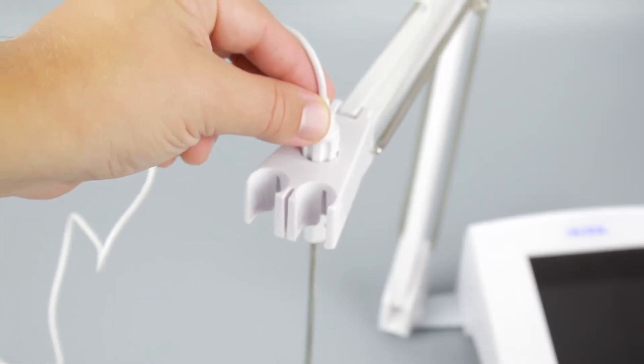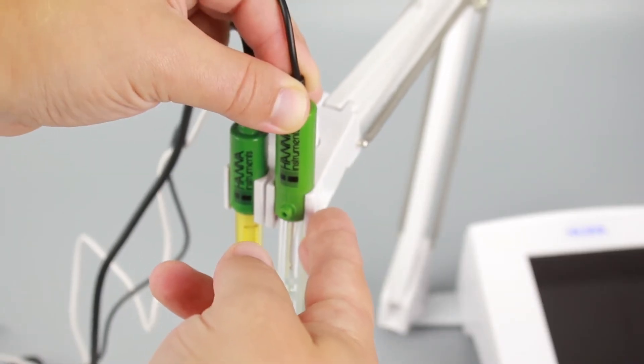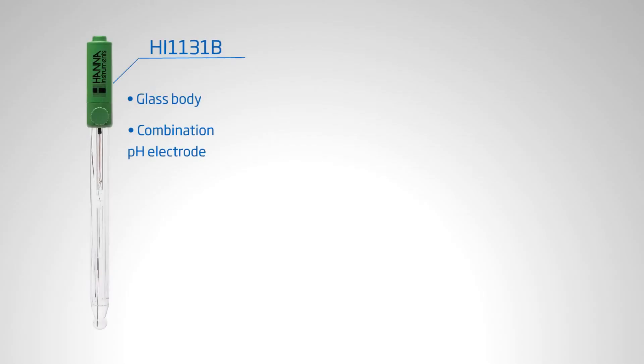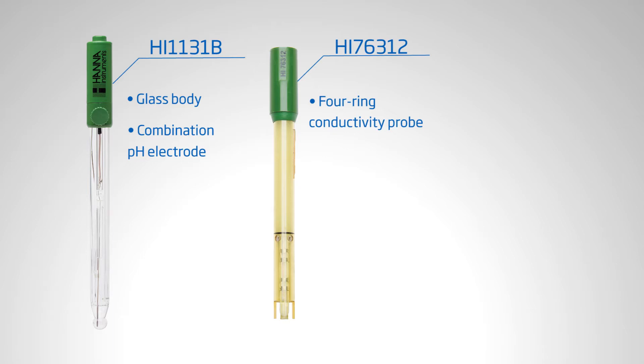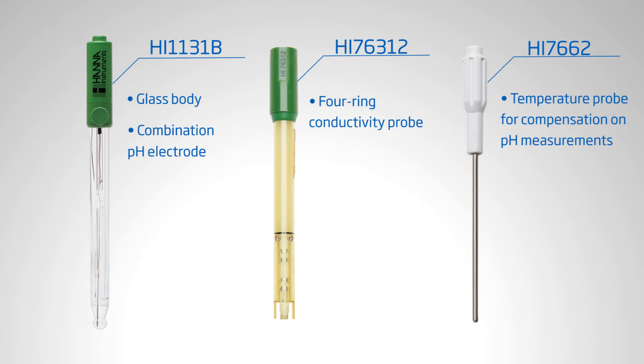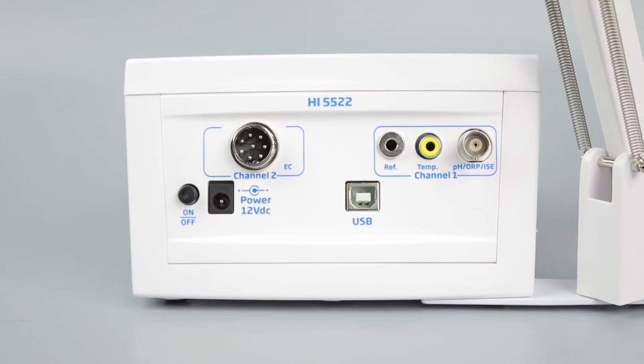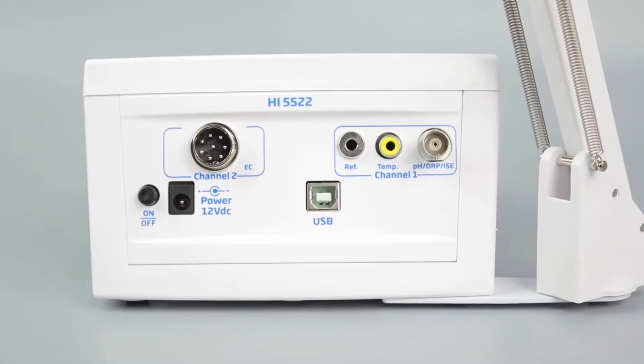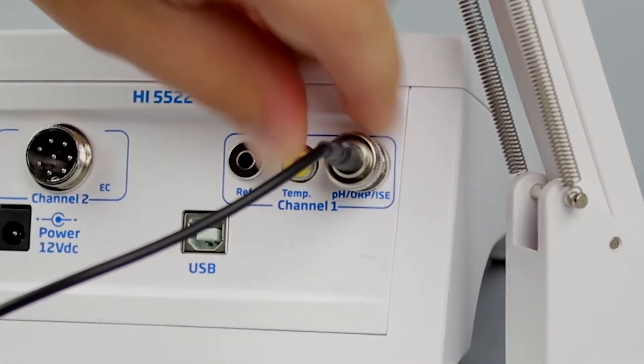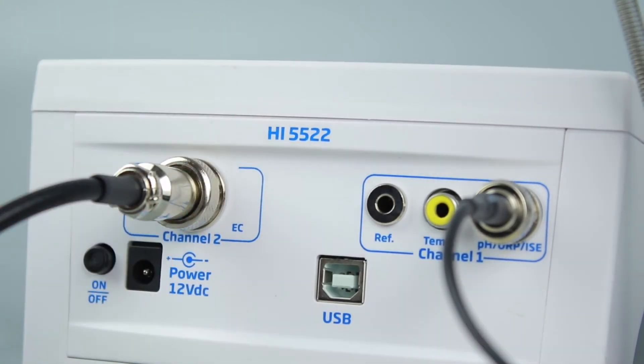To set up your meter, first insert the probe and electrodes into place. The meter is supplied with the HI1131B glass body combination pH electrode and HI76312 four-ring conductivity probe. You'll also find the HI7662 temperature probe for compensation on pH measurements. On the back of the meter, you will see inputs for each channel. Attach the desired sensors to the inputs and make sure that each connection is securely fastened.